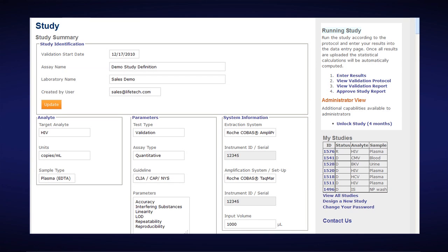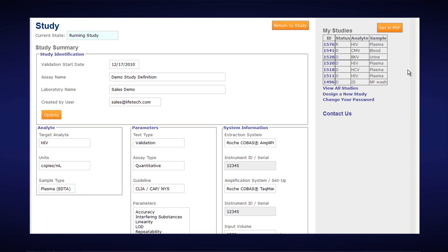At any point during the phase of running your study, you can actually view your validation report. If you go to the right-hand side, you can see the View Validation Report option. You can click on View Validation Report even though the study is not completed and all the data has not been entered — you can view it while in the running study state.